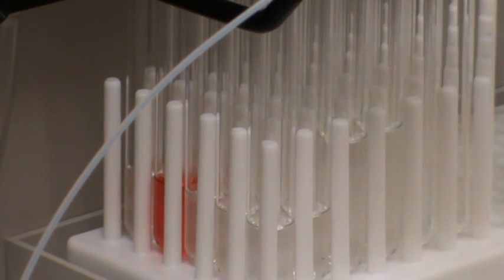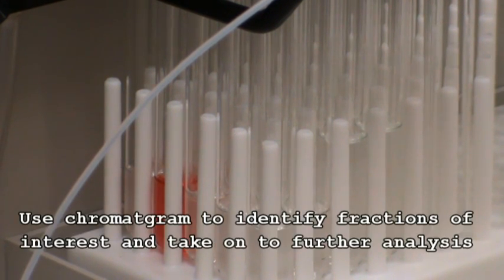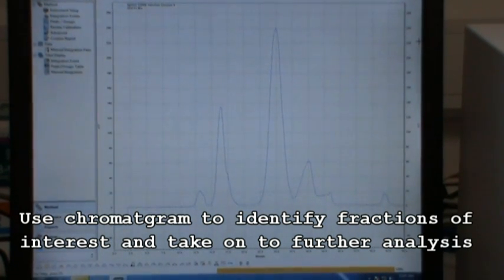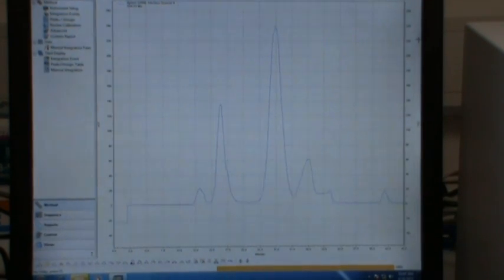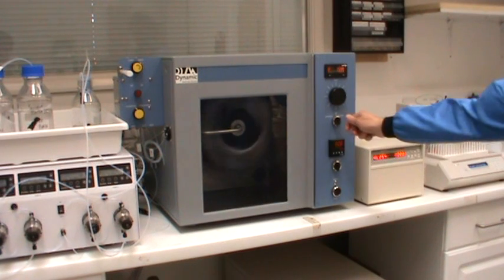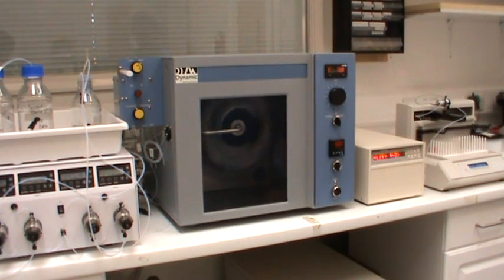Collect the fractions either on a timed basis or a peak driven basis. After around 40 minutes, all the fractions should have been collected. Use the chromatogram to identify the fractions of interest and then take them on to further analysis. Now turn off the CCC instrument and the chiller as your separation is now finished.